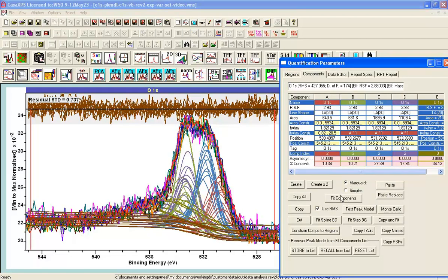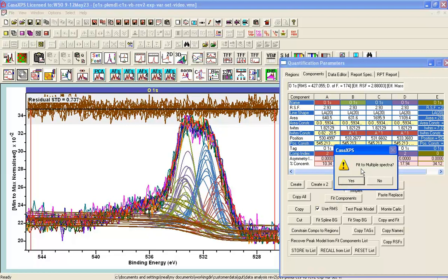If there was a single spectrum in the active tile, it would produce a fit to just that one spectrum. But because we have multiple spectra here, pressing Fit Components pulls up a dialog that says 'Fit to Multiple Spectra' — meaning take the peak model, take the backgrounds defined on each spectrum, and calculate the optimum fit of this peak model to all the spectra together. I'll press Yes.